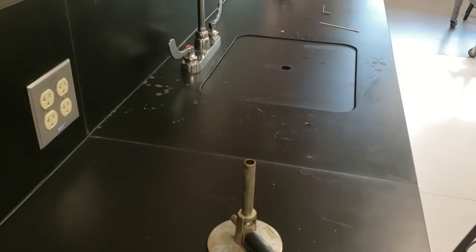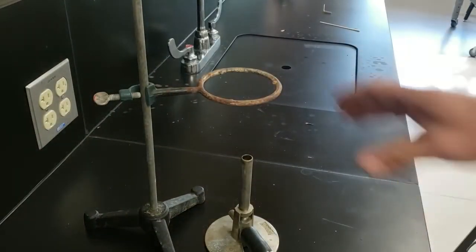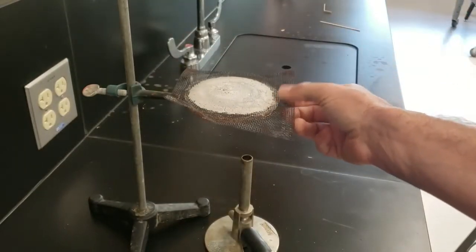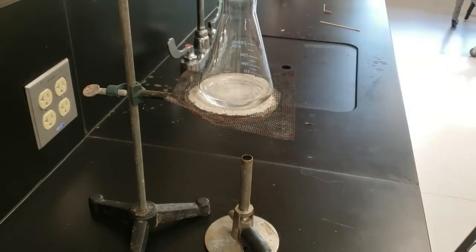All right, so here we are on step 3. We're going to set up a Bunsen burner, ring stand, and wire gauze. So I've got my Bunsen burner. Here is my assembled ring stand. I'm going to place that over the Bunsen burner. And there is my wire gauze pad, and that's going to give me something to set my Erlenmeyer flask with my dissolved material in.